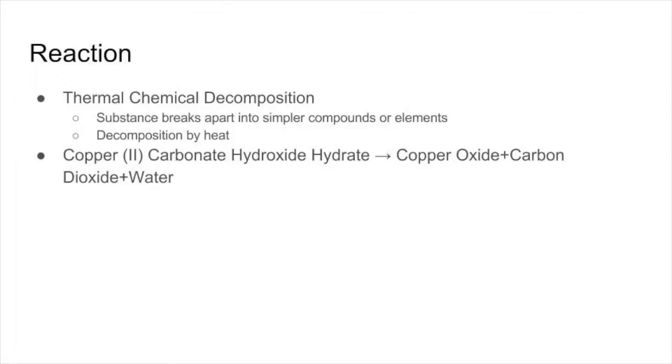The reaction being performed is a thermal-chemical decomposition. The substance will break apart into simpler compounds or elements. The decomposition is caused by heat, typically by a Bunsen burner.